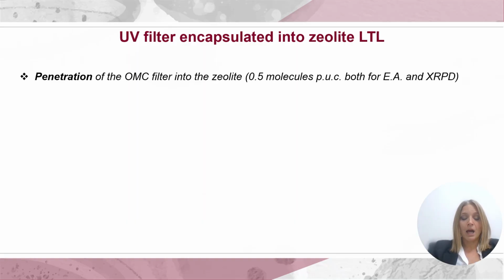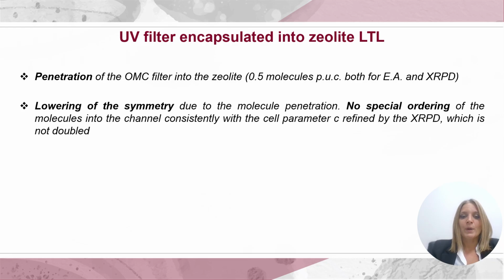In summary, we were able to prove the penetration of the molecules inside the zeolite, which was not so obvious. We were also able to detect some crystallographic changes due to the molecule inside the porosities of our zeolite.